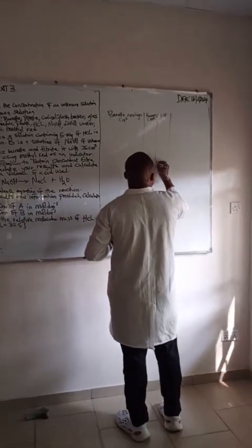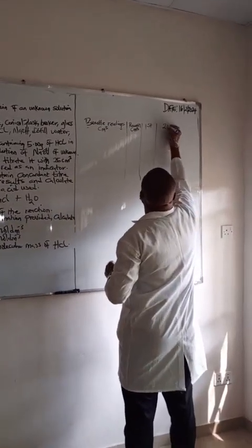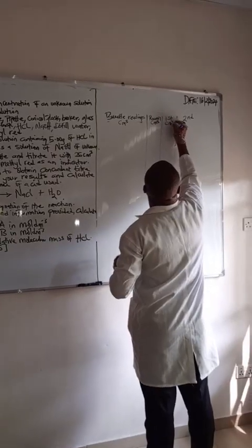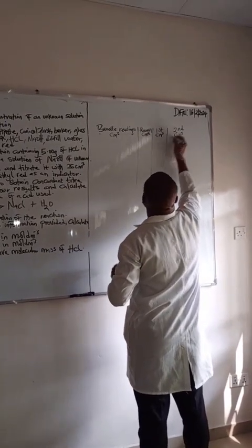This is our first titre, and this is our second titre. All in cm cube.